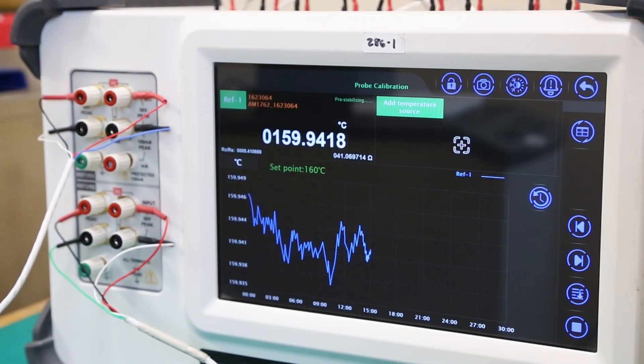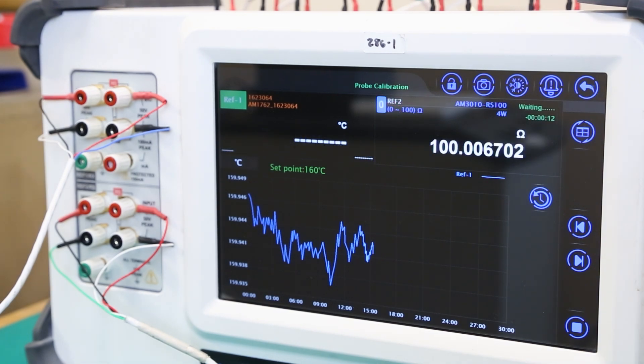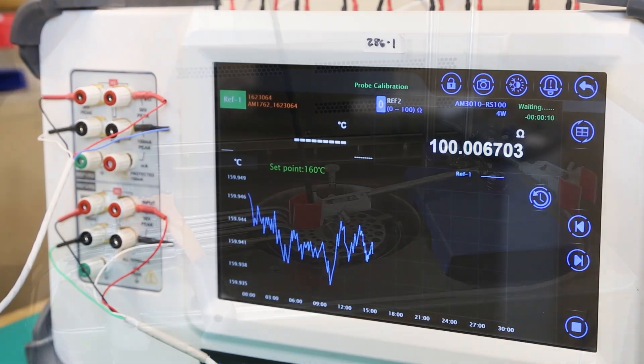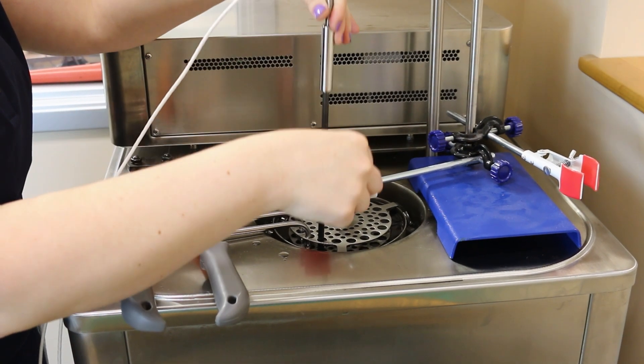Since temperature calibration can often be very time-intensive, it's important to prioritize efficiency in your procedures, especially when working with a variety of temperature control devices.